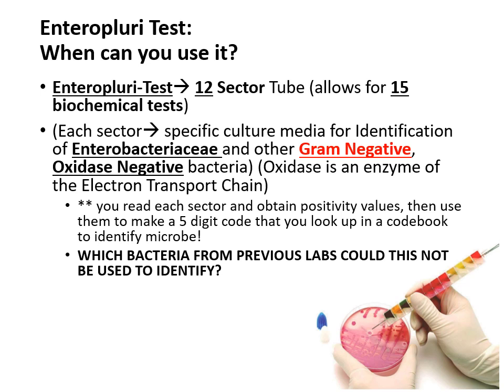With that extra information, it's okay if you don't remember the Enterobacteriaceae term, if you don't remember oxidase negative. What I want you to remember is this will only work to identify gram-negatives, okay? Because ultimately at the end of this, you will look at all 15 of those test results, you will come up with a 5-digit code, and you'll look in a booklet that has the different possible identities based on that number you come up with.